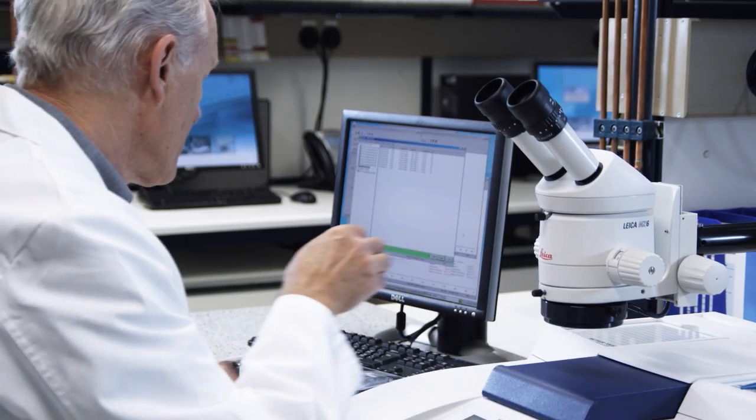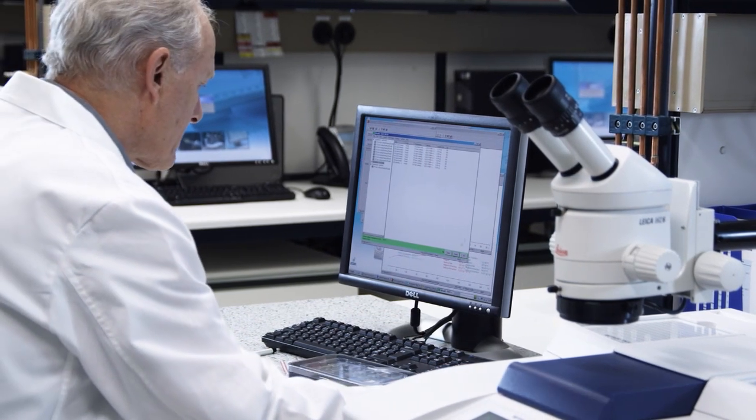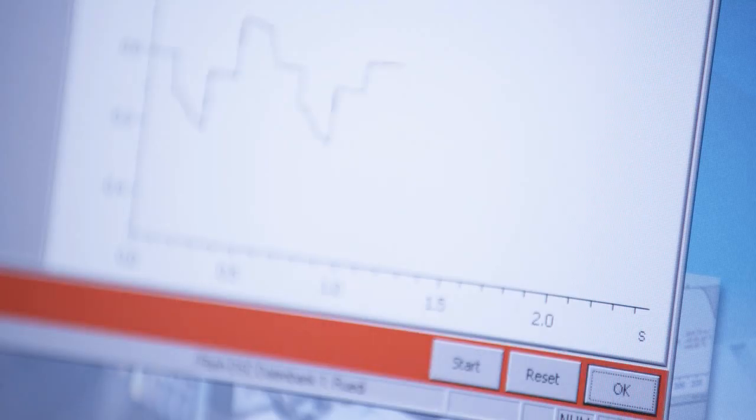The very high heating and cooling rates enable many measurements to be performed in just a few seconds. This generates an enormous amount of new data for evaluation.